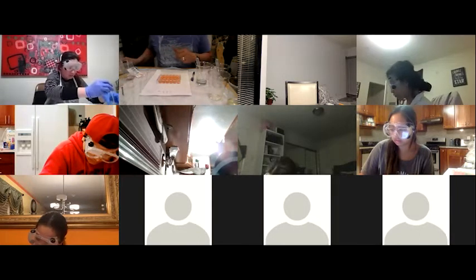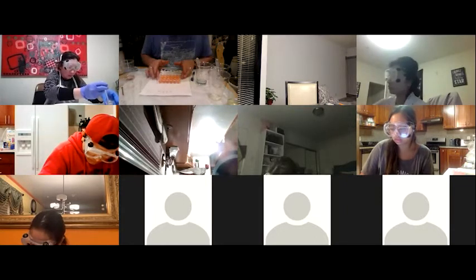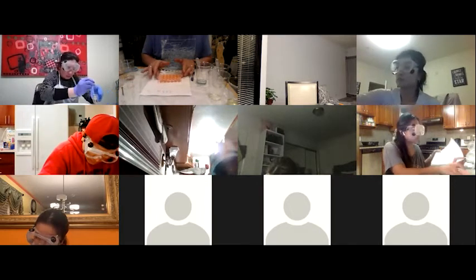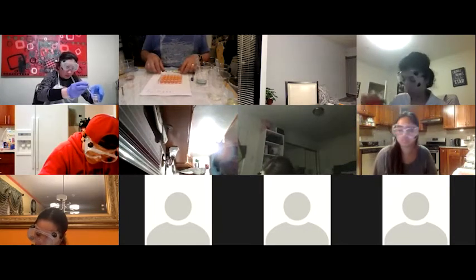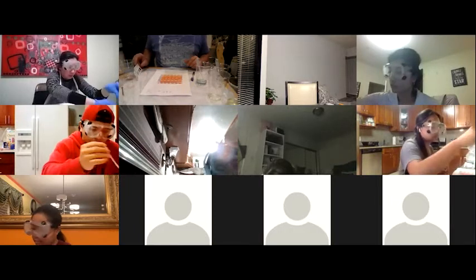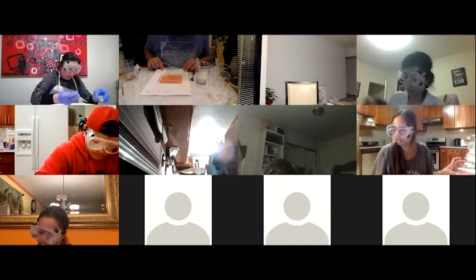Yes, we get a much brighter color with another dab in there. Swirl it around a bit. And we get that nice bright peach color, which tells you that is pH 5. There's no doubt about that.